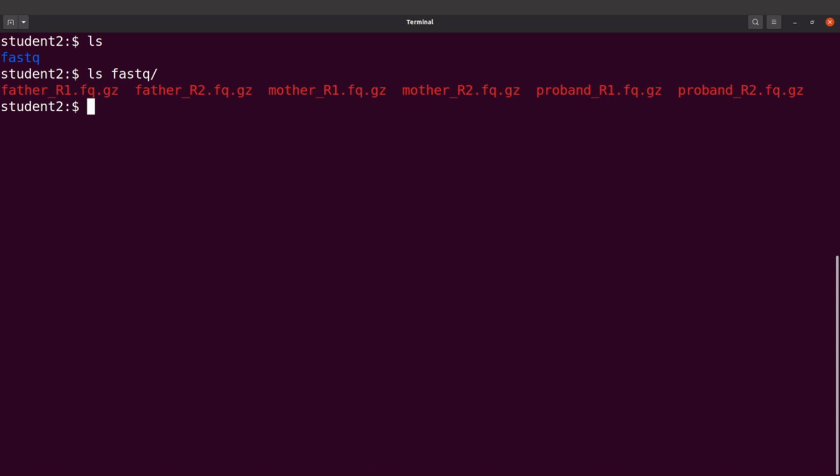I'll give you the step-by-step procedure that you can use to build a pipeline that can be used to map your FASTQ files to a reference sequence. So by the end of this tutorial, you will write a script, and you can use that script to iterate over the samples that you have and then perform your mapping. The script that we are going to develop, you can use it on your own data sets. I will show you how to tweak these scripts and then make them more generic as we go along.